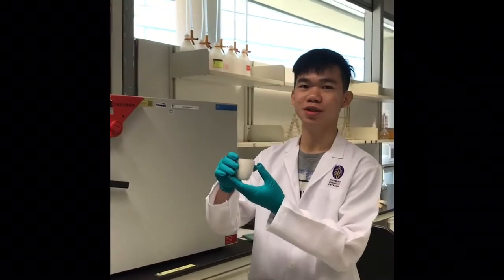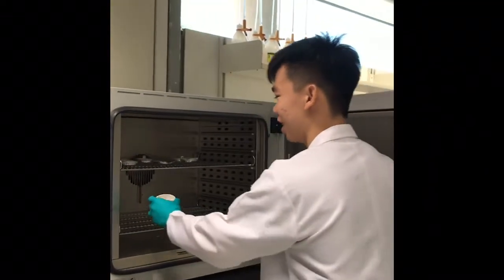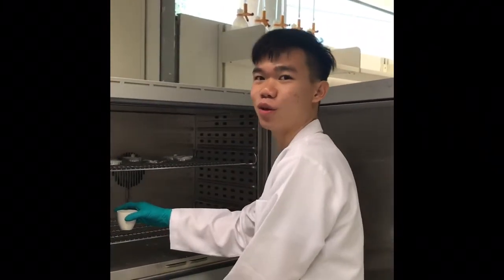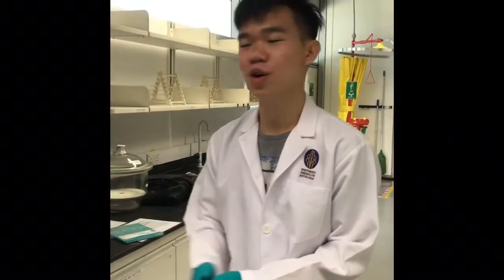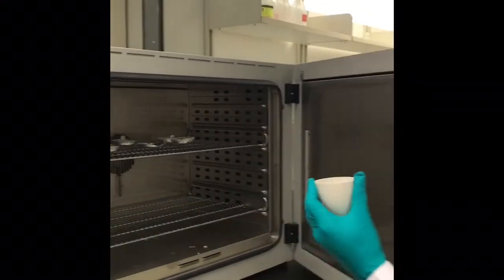Together with the samples, we put the evaporating dish into the oven and leave it at 105 degrees Celsius for 24 hours. After 24 hours, we take out the evaporating dish and we measure the mass.